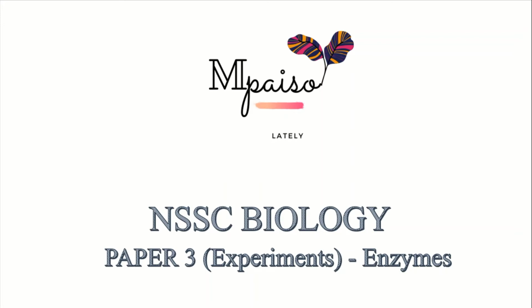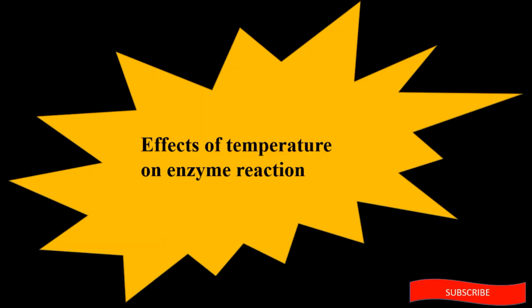Welcome to Mpaiso Lately. This is biology. We are going to look at enzymes, but our lesson is mostly based on experiments. The main topic for today is the effects of temperature on enzyme activities.